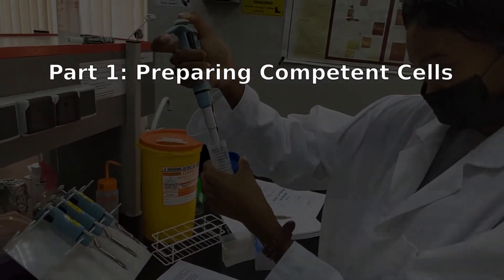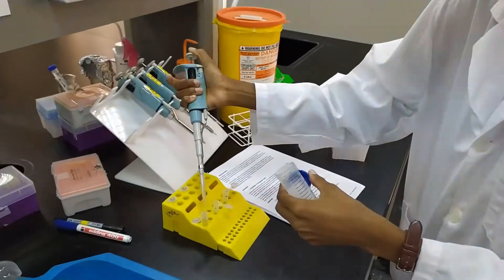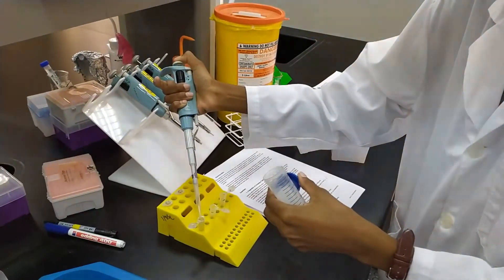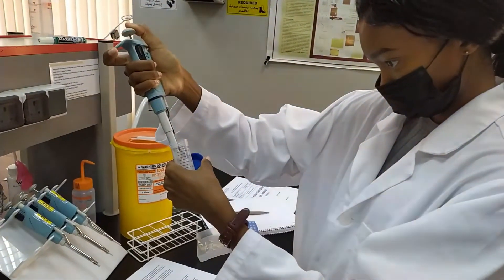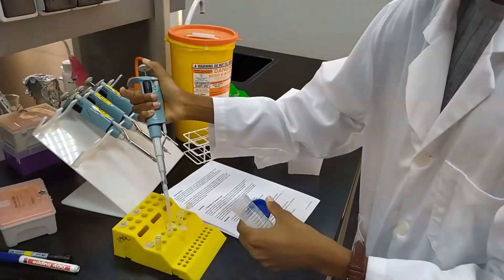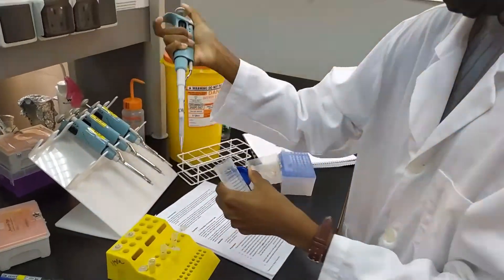You're going to start with a nice healthy bacterial culture and we'll split it up into three epitubes. One of these will later get your ligation mixture — this was the ligation of fragments of DNA with blunt ends. The second culture will receive a different ligation mixture, one with DNA with compatible sticky ends. And the third culture will not receive any DNA. This will be our negative control.